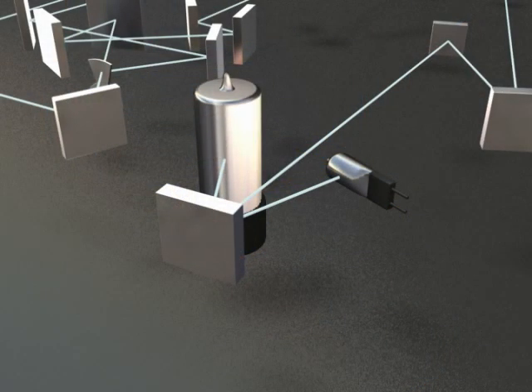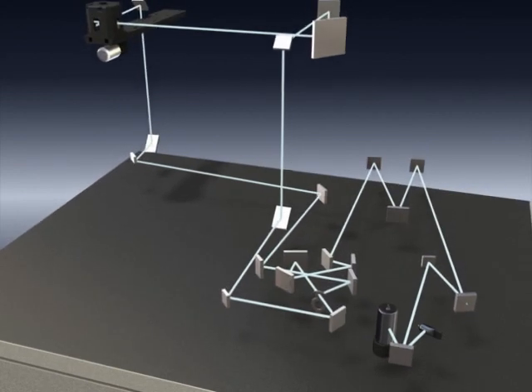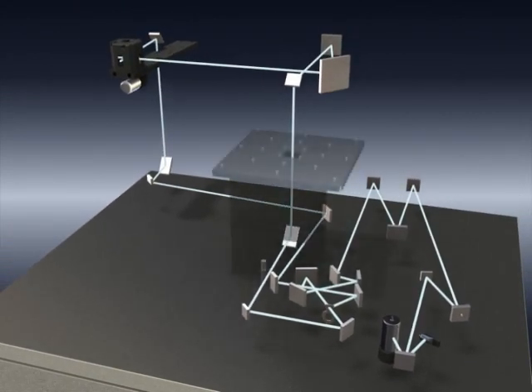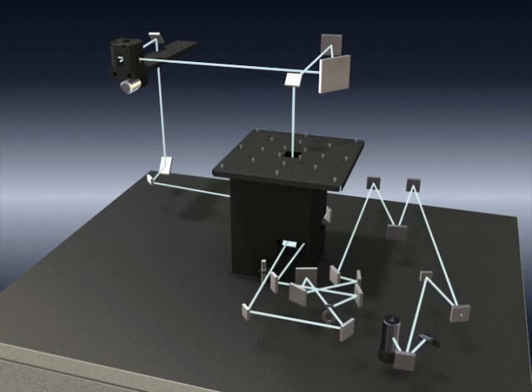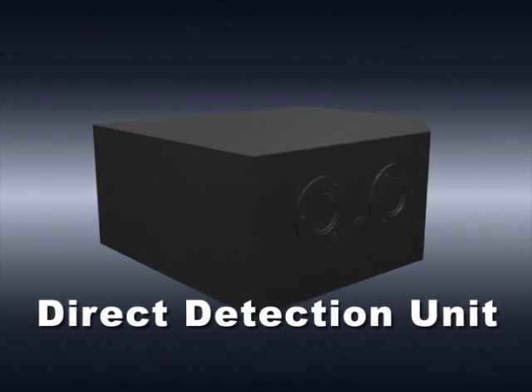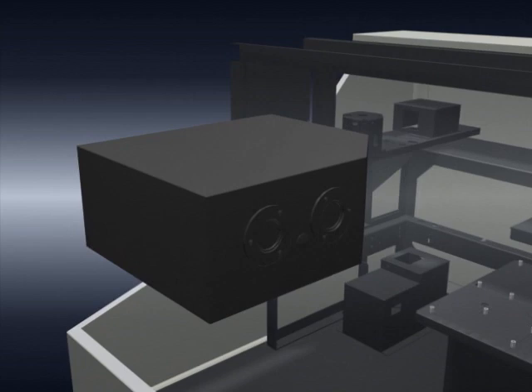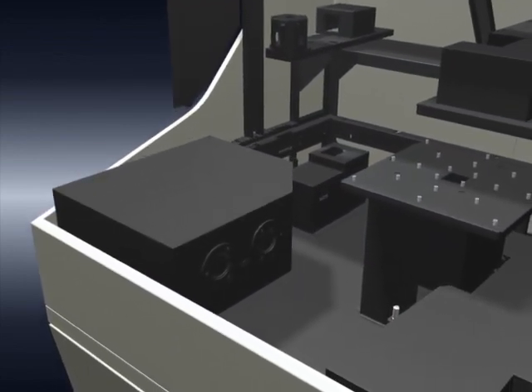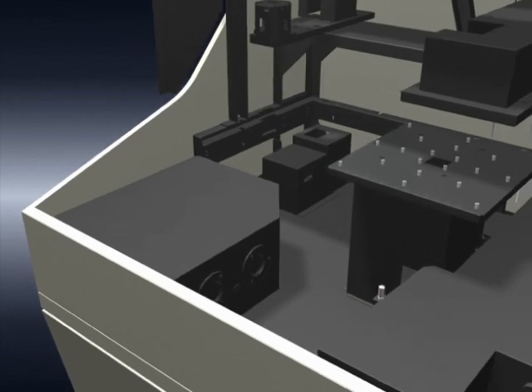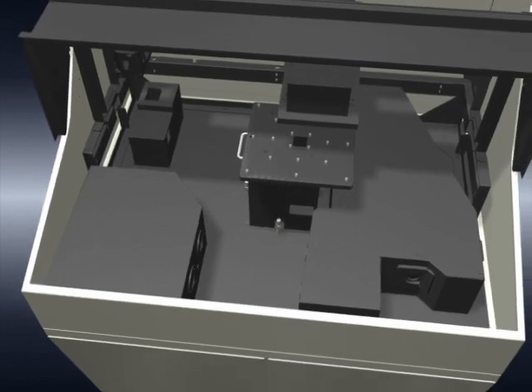The utilization of three-dimensional optics makes it possible to perform measurement of the sample simply placed on the sample stage. This horizontal placement system is far more convenient than the conventional system where samples had to be positioned vertically. If an optional direct detection unit is used, spectra can be measured without the integrating sphere, allowing highly sensitive measurement of wavelengths as short as 165 nanometers. Switching between the direct detection unit and the integrating sphere simply requires the attachment or removal of the transfer optics mirror unit.